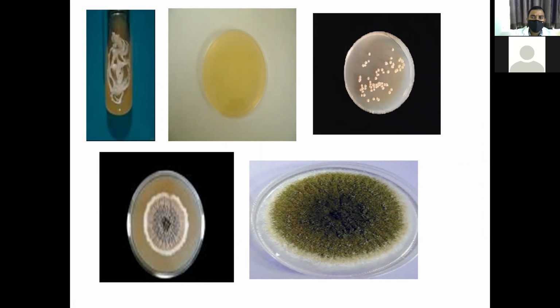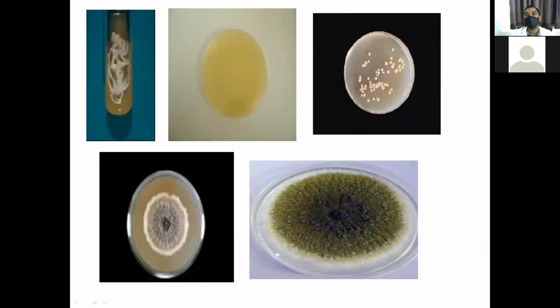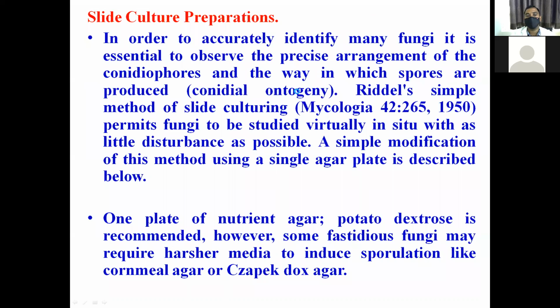I already told you, LPCB contains phenol crystals, lactic acid, glycerol, distilled water, and cotton blue. These are the ingredients in LCB, lactophenol cotton blue. This one is Sabouraud dextrose agar media.